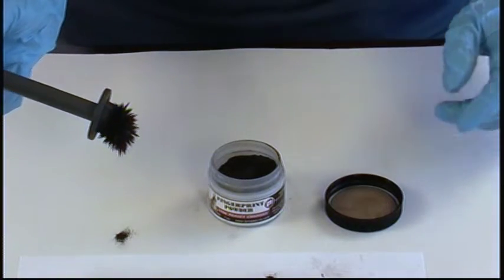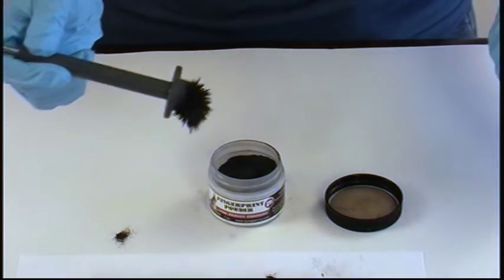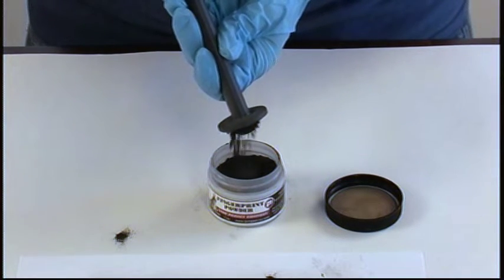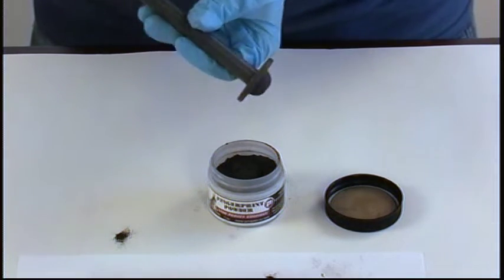You can see this is developing nicely and that looks good. Now that we've finished developing our print, let's put the rest of this back into the pot. Hold it right over the top, pull up on the plunger, see how it all falls off.